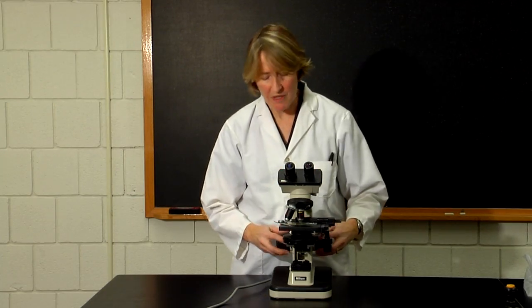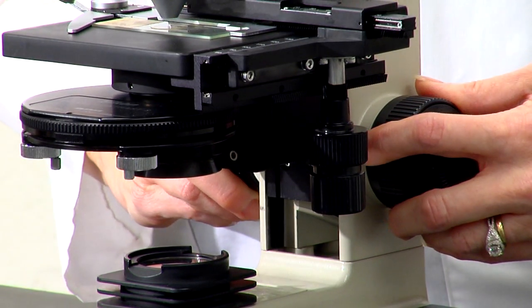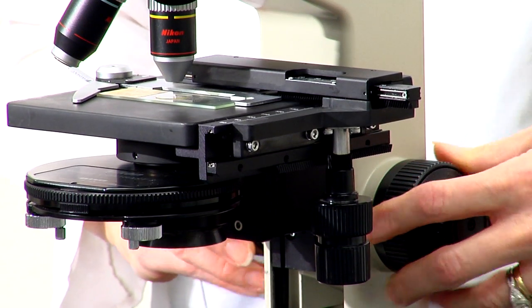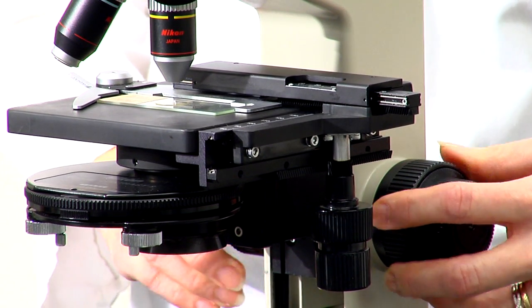Looking through the eyepiece, you should use the coarse adjustment knob to get the sample into focus. Notice that by starting with the stage in the highest position, as you move the coarse adjustment knob, the stage moves away from the lens. This decreases the possibility that you could potentially smash the lens into your slide.